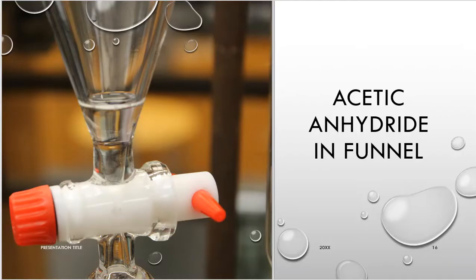So the acetic anhydride that we have just referred to is actually going to go into the separatory funnel. The lab directions tell me 1 milliliter. And I did weigh out 1 milliliter using a micro pipette. So this was very convenient for me. I didn't need a super tiny graduated cylinder. I just micropipetted 1 mil into a separatory funnel, and it was 1 mil exactly, and the lab directions are going to tell me to add it in small portions.